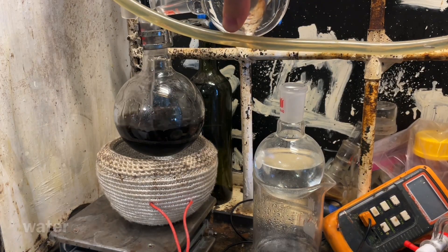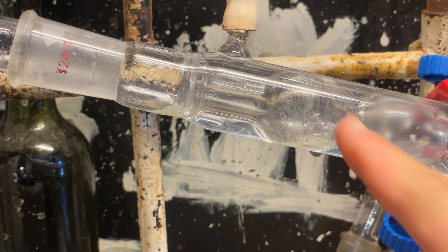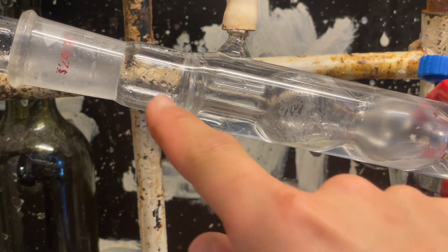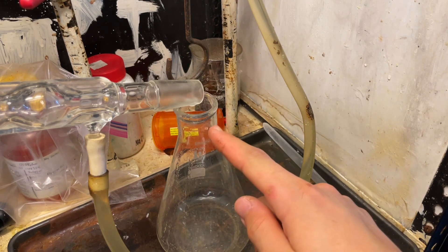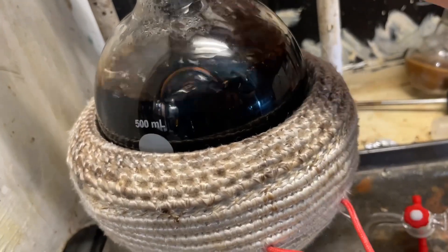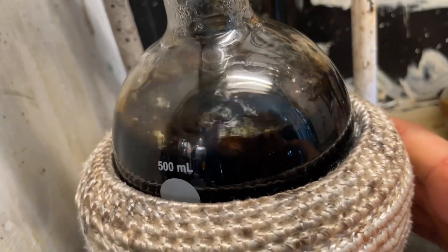So now we're going to steam-distill out any remaining nitrobenzene. I'll add water and steam-distill until the distillate is clear and no longer smells of almonds. You can see here our nitrobenzene is distilling over, and I'm going to recycle this nitrobenzene into the bottle again because it's perfectly fine and reusable. A Discord member commented: 'soy sauce distillation.'